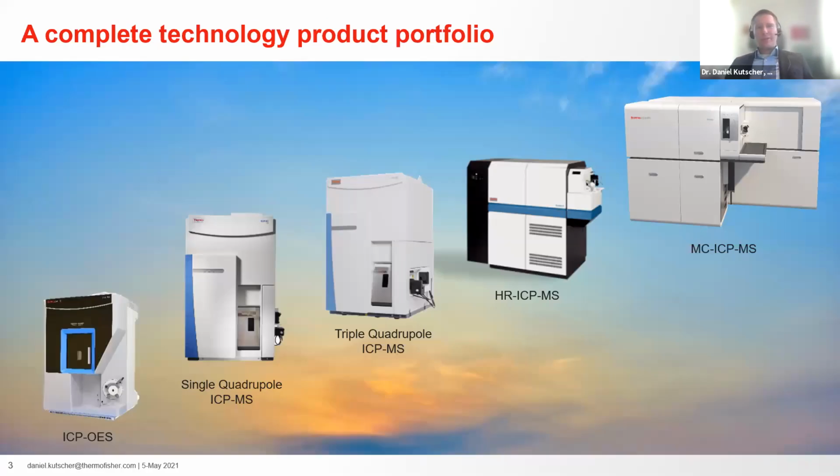So let's talk about the ICP-MS side of things as, let's say, the second part to construct an imaging tool set that can be applied in order to determine elements in a spatial resolution across, for example, a thin section of tissue. For elemental analysis, there's a number of different instruments available, which you can all see here in this slide. And this starts, for example, with ICP optical emission spectroscopy, a technique that you can see on the left-hand side. You might recall this, maybe for those of you that did analytical chemistry at university. You might have used one of these instruments back in the days.